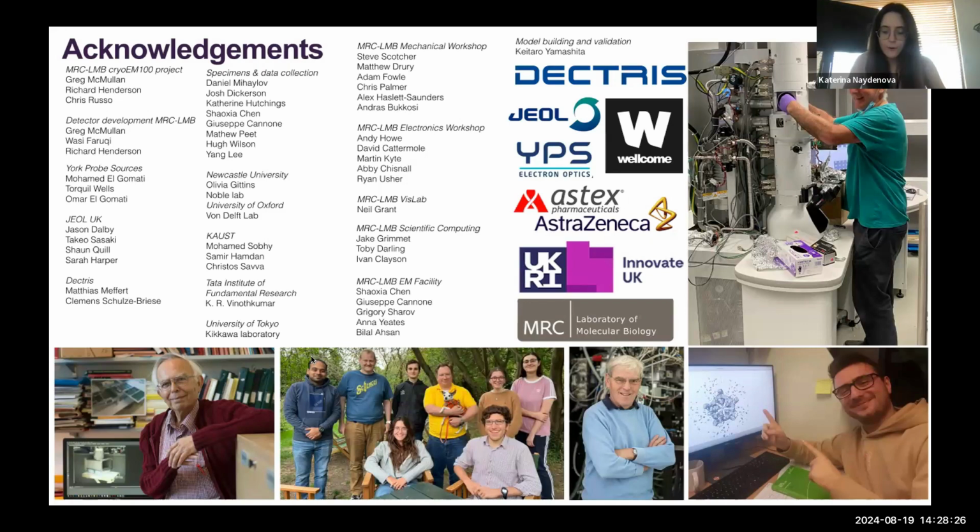No, actually, I have not. I have not had personal contact with them, but I recommend everyone to have a look at their preprint on bioRxiv. Yes, it takes a lot of patience. I think they did have automation on this microscope, which makes it slightly less painful. But still, yes, you need to get more data to compensate for the slightly lower quality. But it is interesting in itself that it is possible at all to use such an instrument.